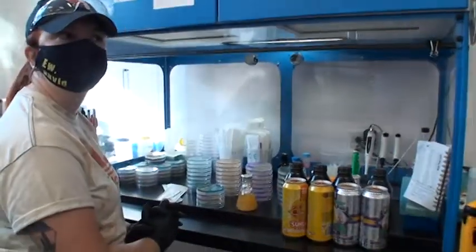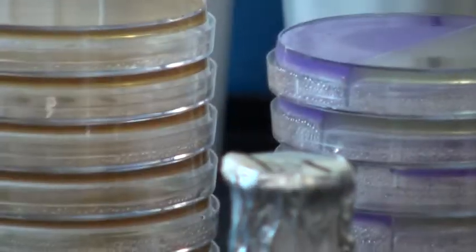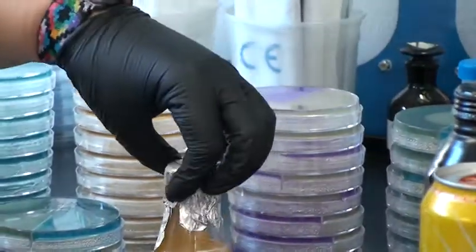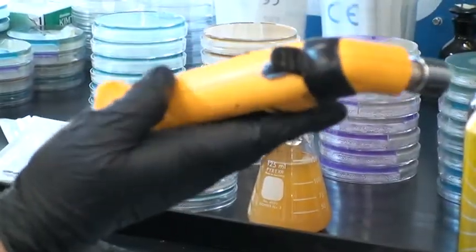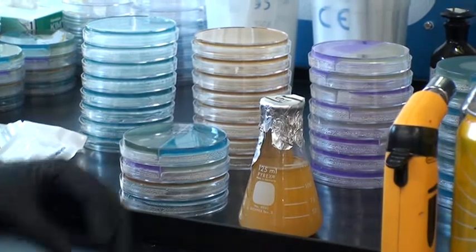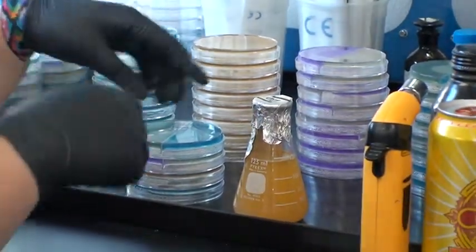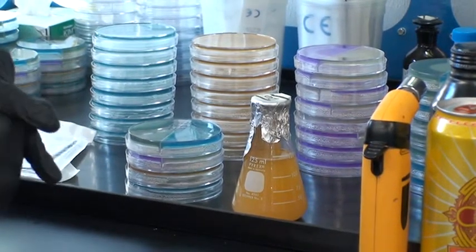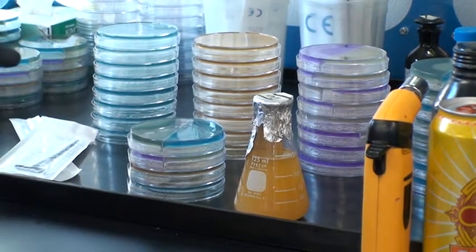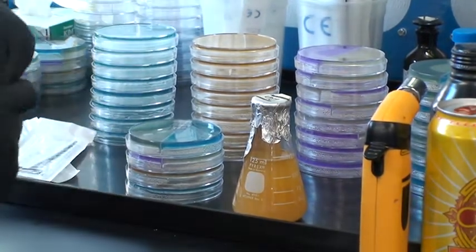And what is that process? So I just take one of these and I've got my little torch, and then I'll flame the outside and the port on the fermenter. That's just capturing a sample of the beer out of the port on the side of the fermenter — or the bright tank in some cases.